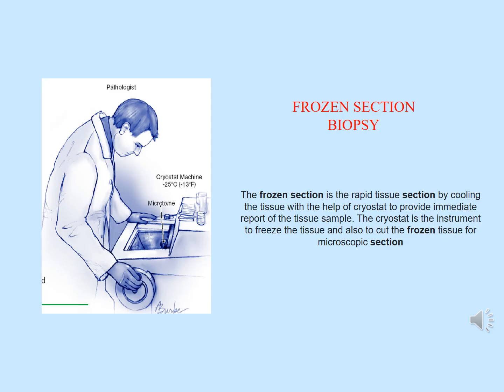So let's move on to the next biopsy technique, which you should know. This technique is called frozen section biopsy. Frozen section is a rapid tissue sectioning by cooling the tissue with the help of a cryostat to provide an immediate report of a tissue sample. The cryostat is an instrument to freeze the tissue and also to cut frozen tissue for microscopic sections.